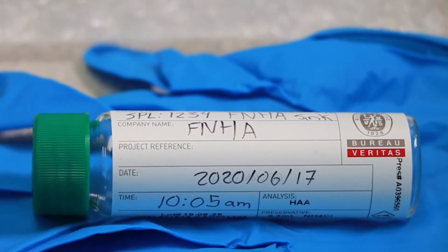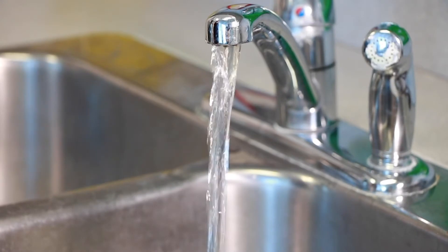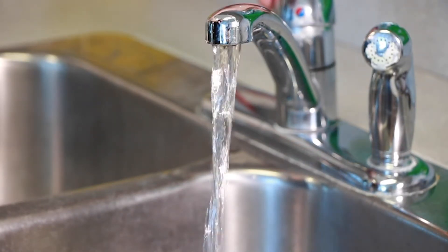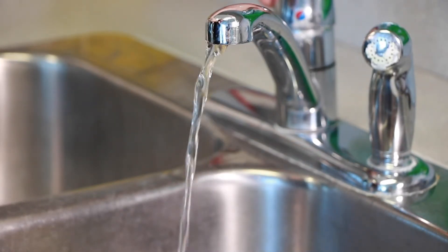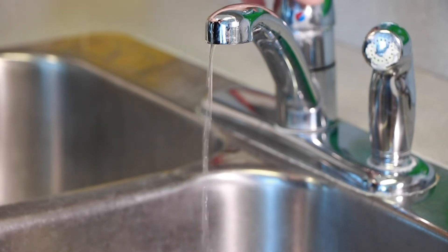This is what a completed label looks like. Now that five minutes have passed, slow the flow of the water down to a trickle. This will take more time to fill the vial, but it will be less likely to spill or splash out the preservative.